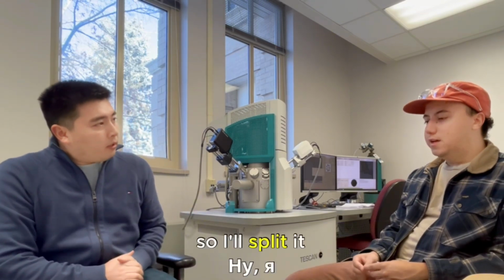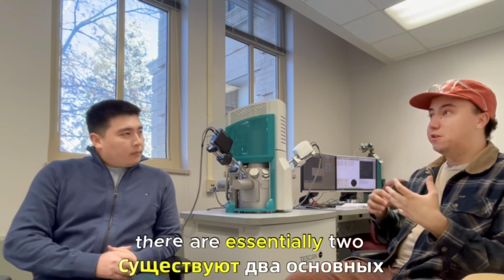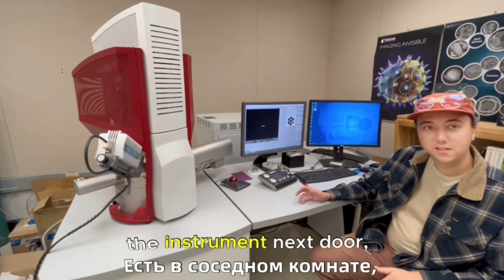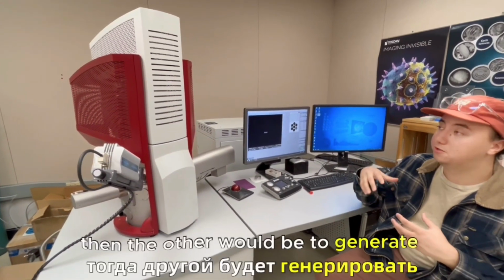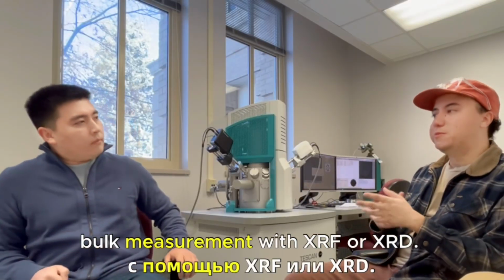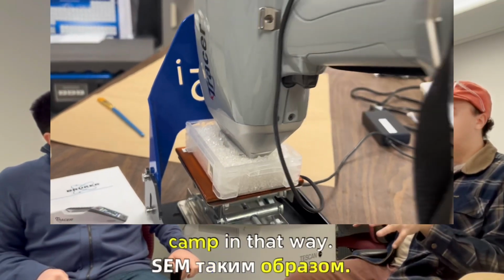Sure. Yeah, so I'll split it up a little bit. With SEM, for what I do, there are essentially two major applications. One of them is imaging and point analyses, which would be the instrument next door, the Mira. And then the other would be to generate some sort of quantitative analysis over an entire sample, very similar to a bulk measurement with XRF or XRD, and that would be automated mineralogy. So I'll split the SEM camp in that way.